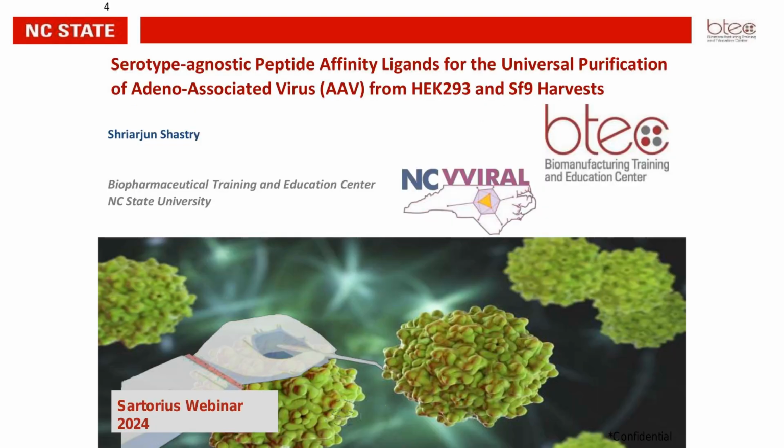Now, getting into the topic of today's webinar, I would like to initially talk briefly about the research that I've been doing for the past few years, and then tell you how in the recent past we have utilized PATfix to streamline our research process. My research was focused on developing serotype agnostic peptide ligands, affinity ligands for universal purification of AAVs from the cell culture fluids of HEK293 as well as the Sf9 harvest.